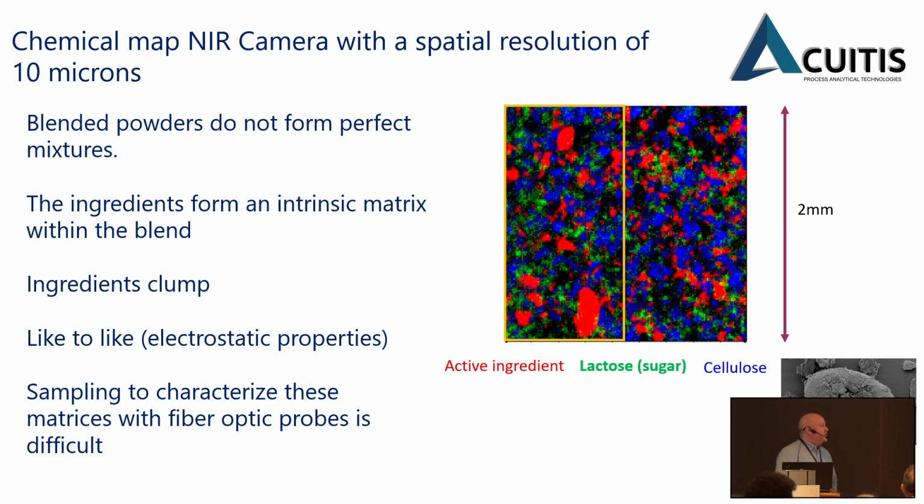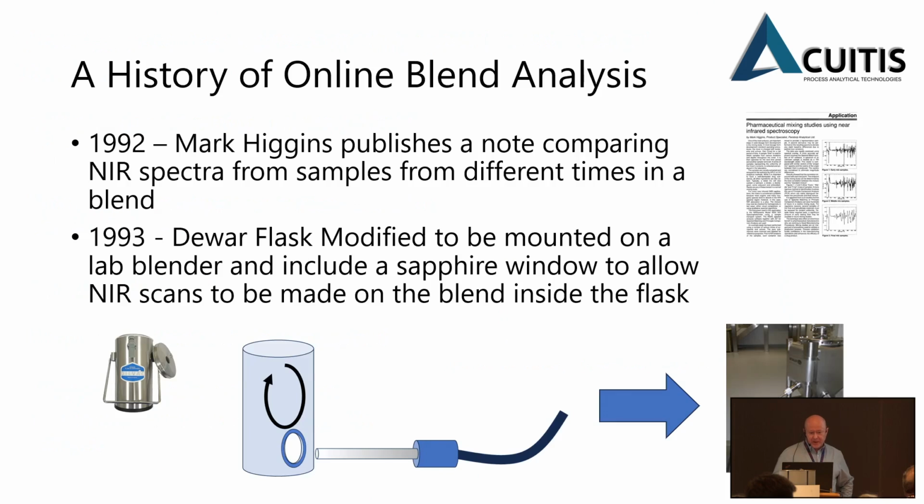And here I like to use this illustration, which is an electron micrograph of a blend, and you can see that in this example, the large particle is the disintegrant within the tablet formulation, and the API has selectively coated the surface of the disintegrant particles themselves. So a little bit of a time machine step back.